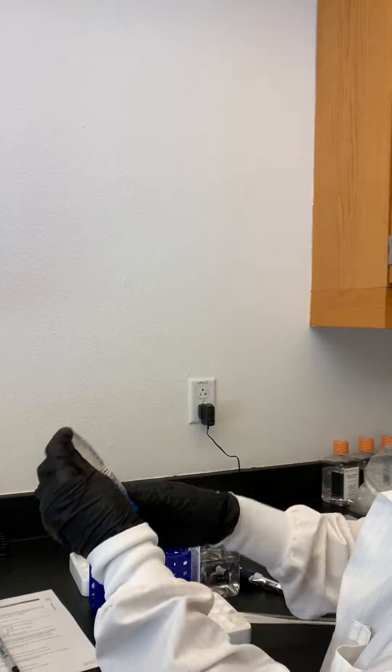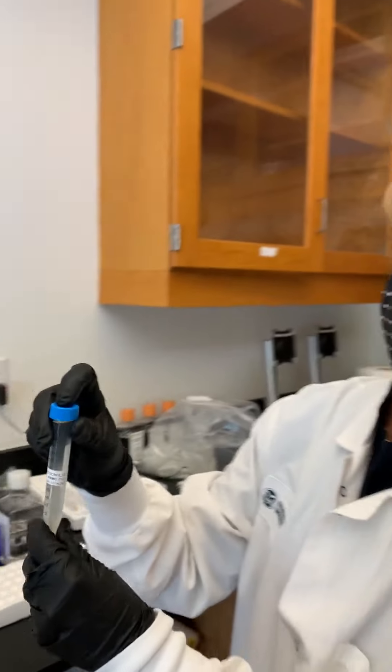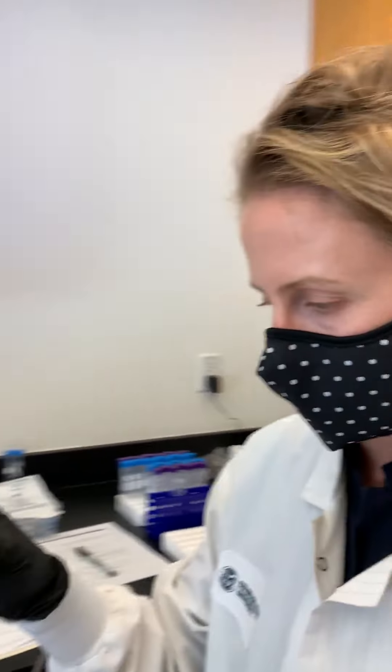Okay, so we're inverting. Now we're going to go over to the centrifuge and we are going to change the speed. This is the only time you're going to change the centrifuge speed.